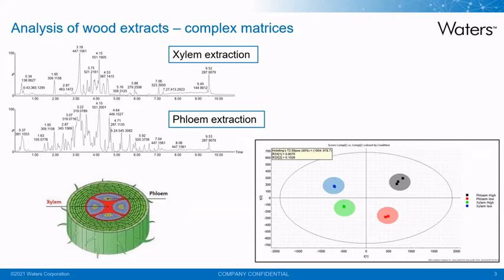From just looking at the difference between these two different tissues, you can tell the difference quite easily, and building that into statistics, just looking at the features themselves, we can happily differentiate between these different tissues. But when it comes to actually looking at why these tissues are different, what molecules specifically are driving that statistical difference, and identifying them, that is where the issues can come up.